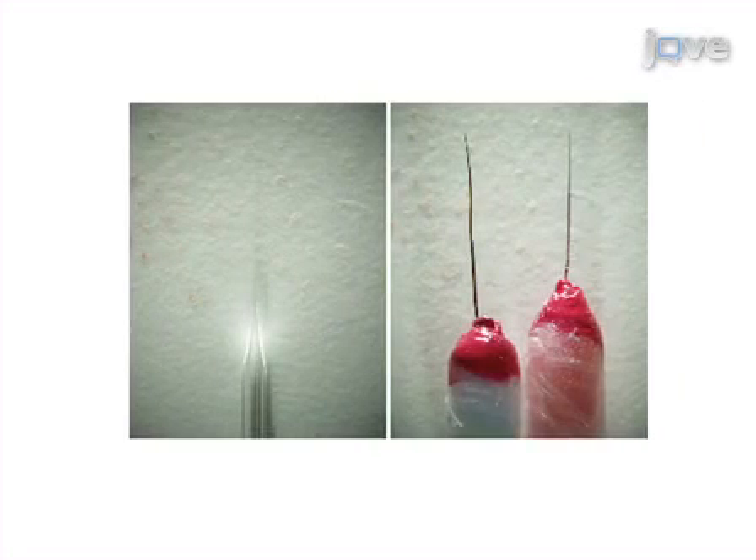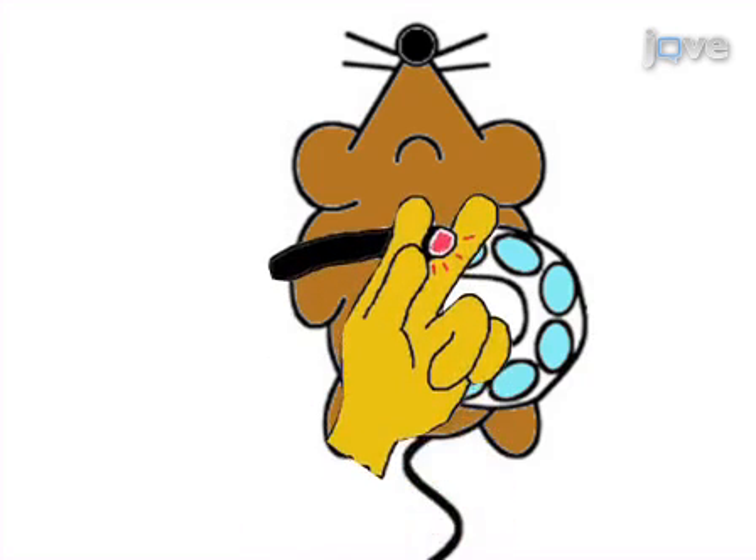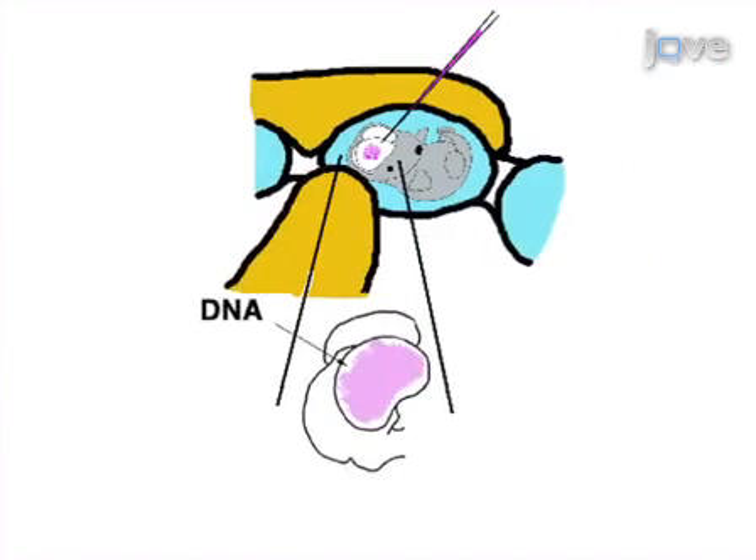This is accomplished first by preparing precision capillaries and needle-type electrodes to prevent uterine damage. The second step of the procedure is to learn a unique holding method of embryos using a fiber optic light cable to visualize small embryos for targeted DNA injection.